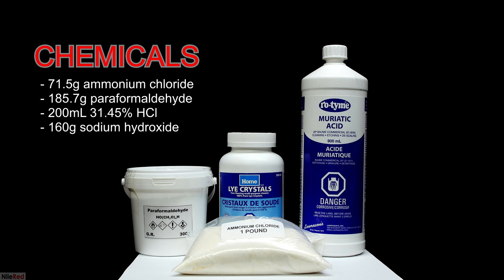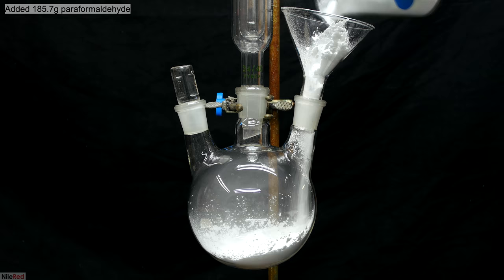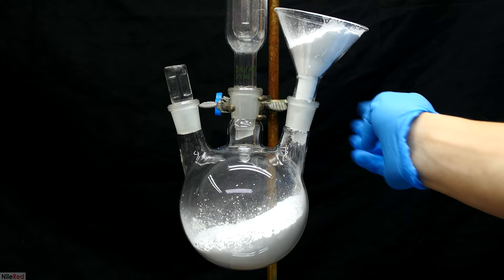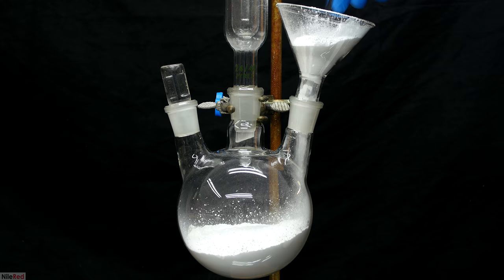I start to prep out by first adding the paraformaldehyde. I'm adding it to a three-necked round bottom flask where in the middle you can see I've already set up a reflux column. Some of the powder got stuck in the funnel and I tried to liberate it by tapping it but it didn't work too well. To loosen up the powder it was much easier to just use something like a glass stir rod.